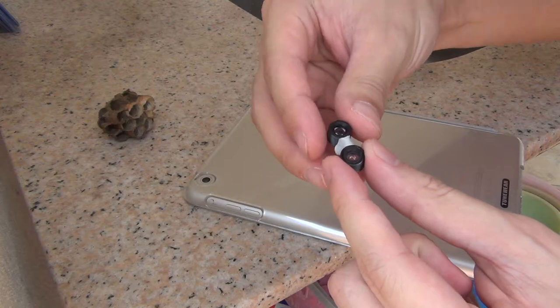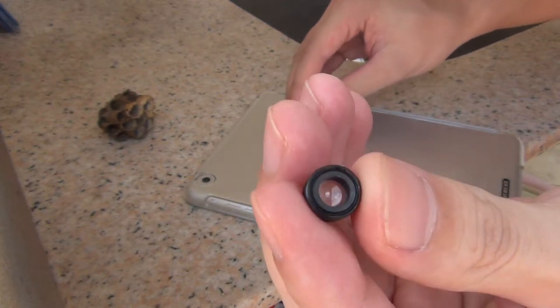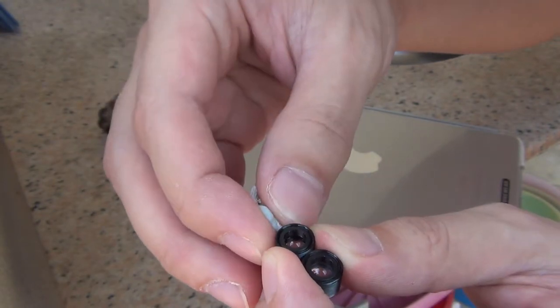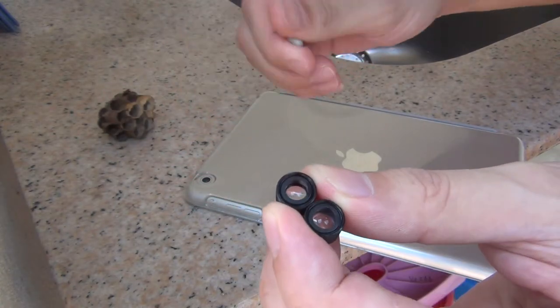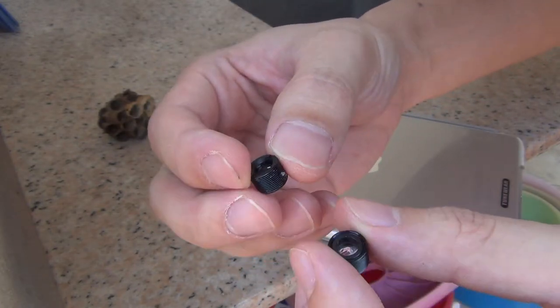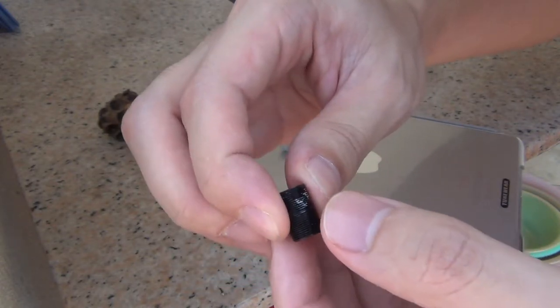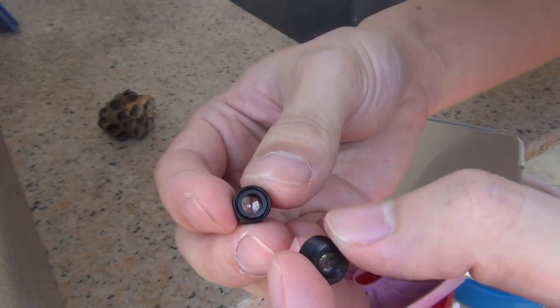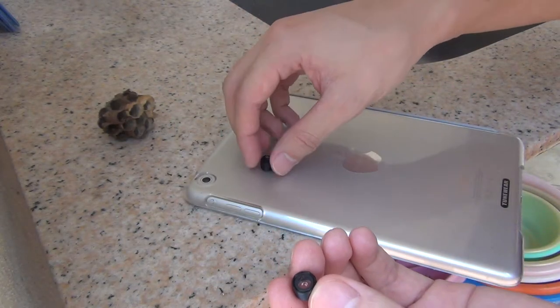As you can see, these two little black tubes each have a glass bead in them, and the diameter of the glass bead is probably about six or seven millimeters. I didn't make these myself — I was given these by my boss, because he's also a geek like me. I think these tubes are 3D printed and the glass bead is embedded in them while it's being printed. So the way it works is pretty simple.